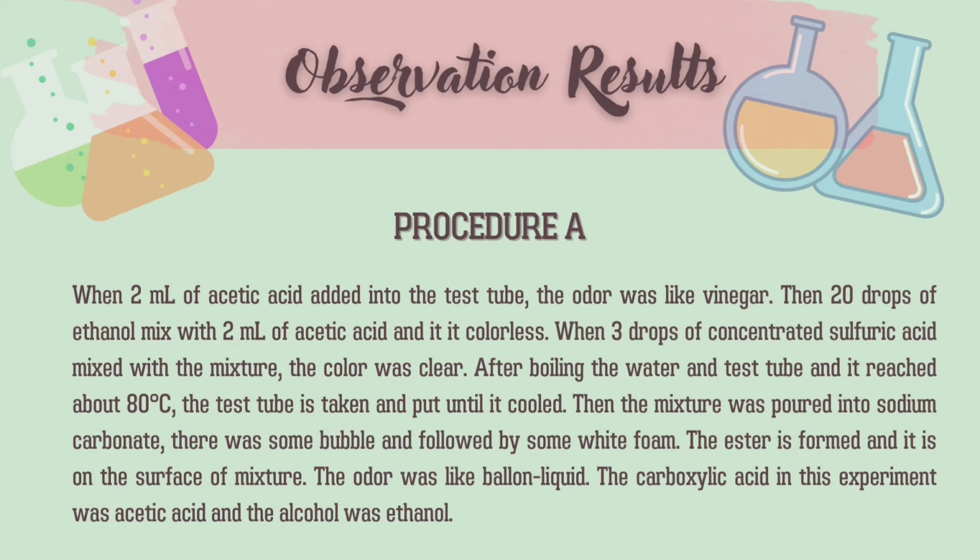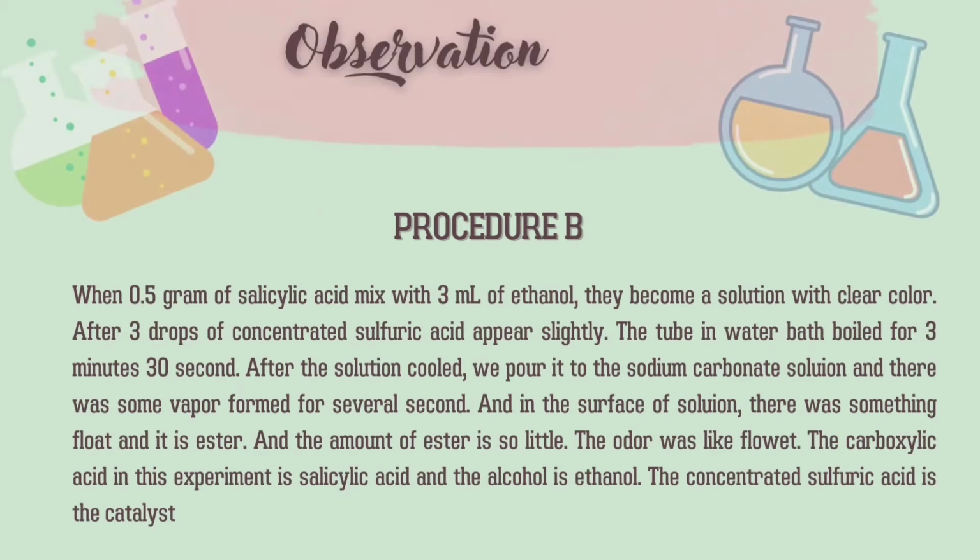Then the mixture was poured into sodium carbonate. There was some bubble followed by some white foam. The ester is formed and it is on the surface of the mixture. The odor was like balloon liquid. The carboxylic acid in this experiment was acetic acid and the alcohol is ethanol.